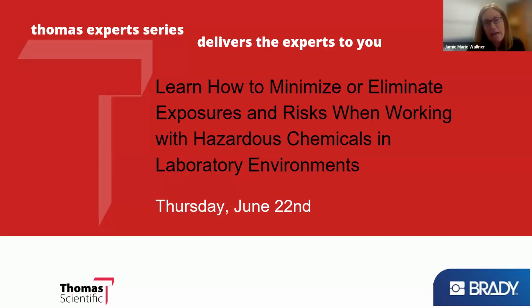The ideal lab for identifying safety needs is a lab that is custom built with safety in mind, where we've designed homes for our spill kits, our benchtop printers and labels, where we've made room for our signage. While this is a lovely thought, honestly, it's not most of our realities, including mine here at Brady. So I'm going to focus on existing labs.